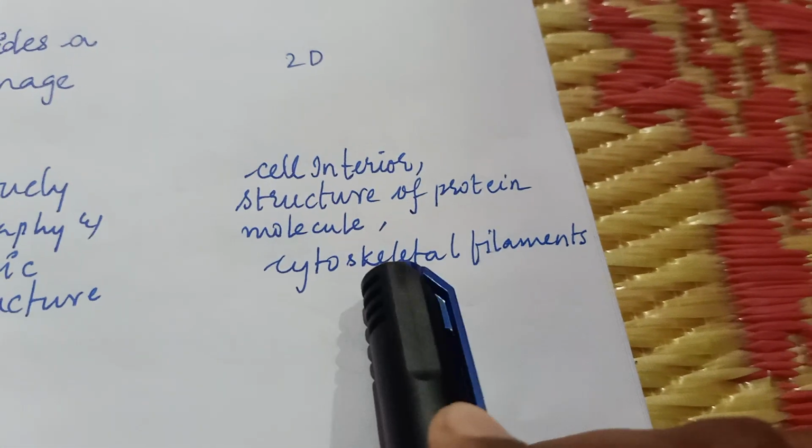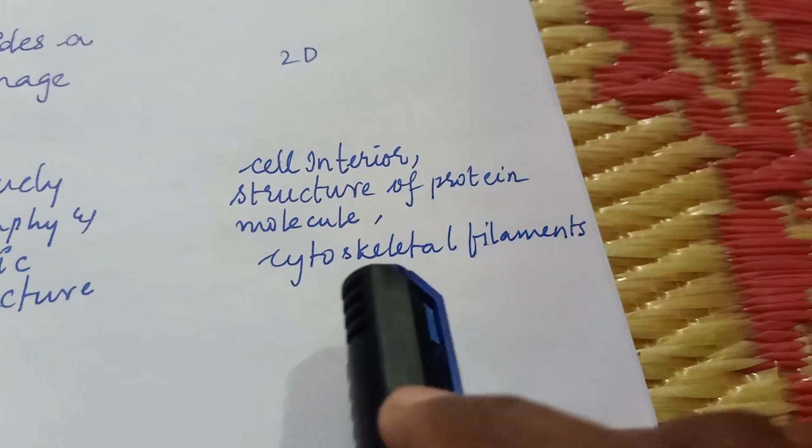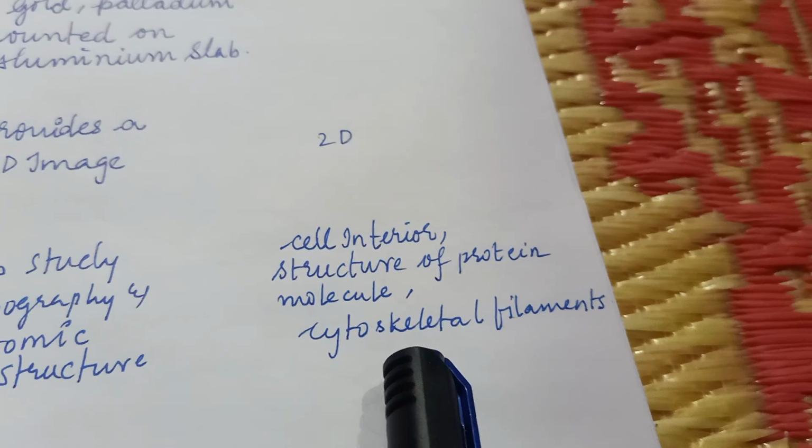Whereas to study the cell interior, the structure of a protein molecule, or cytoskeletal filaments, we use transmission electron microscope.